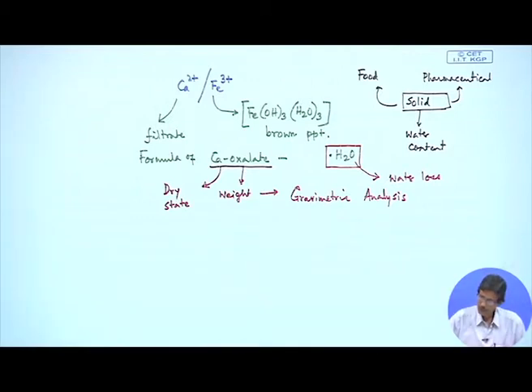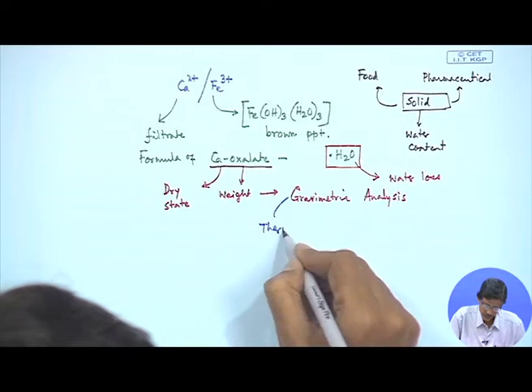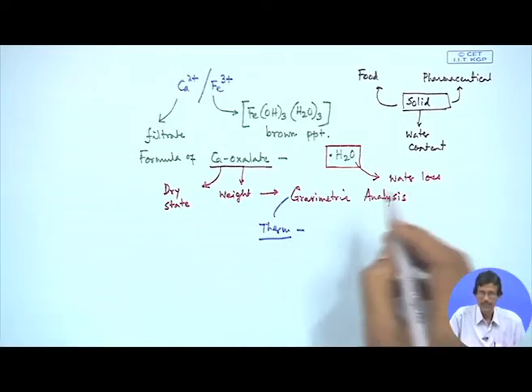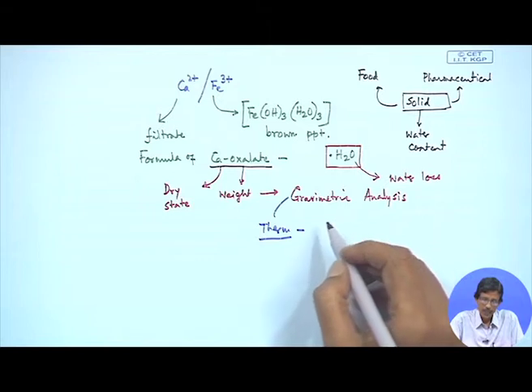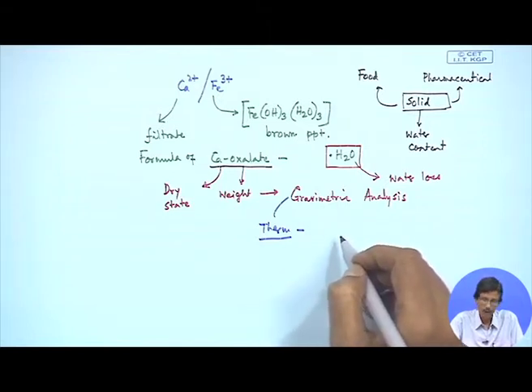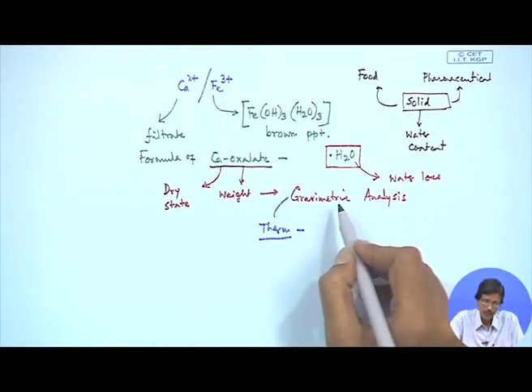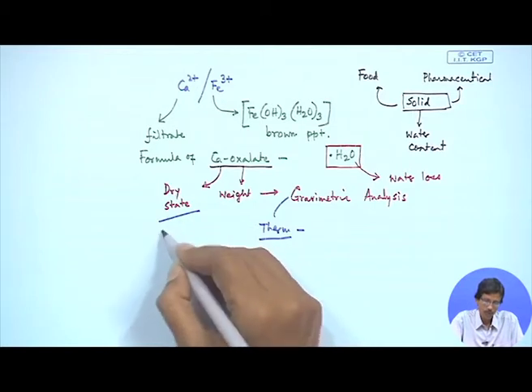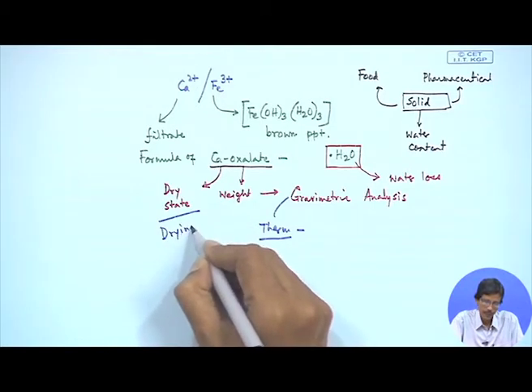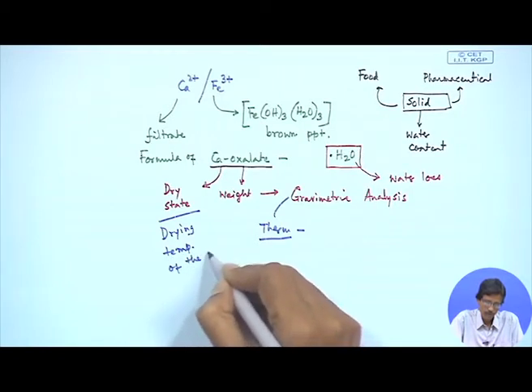So, this thermogravimetric estimation is directly related to the typical gravimetric analysis, and if we put that, that means the temperature, the thermometric part, temperature when we add and if we go for the corresponding weight loss of the whole sample, what we find that with regard to the temperature, not only the drying temperature, because this will also give you the drying temperature of the precipitate.